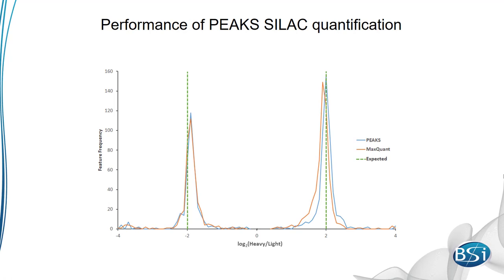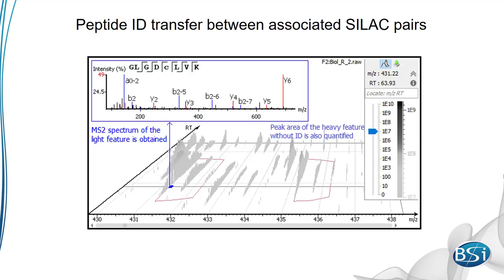The next important improvement to our method was peptide ID transfer to limit missing values. To deal with this, PEAKS uses peptide ID transfer. The first application of this is in peptide feature pairs. For example, here, even though an identified MSMS scan wasn't found in the heavy peptide feature, it could be transferred from the light peptide feature. So, quantification within the sample could be performed.